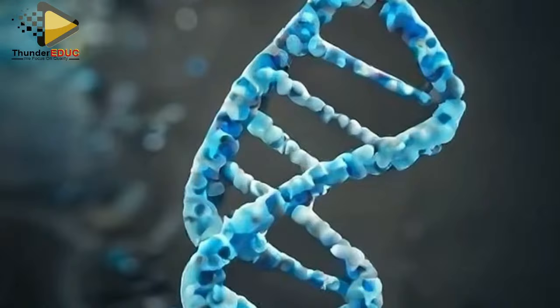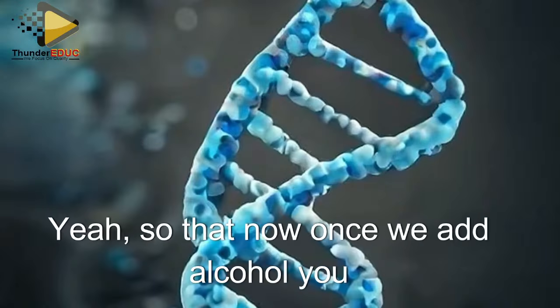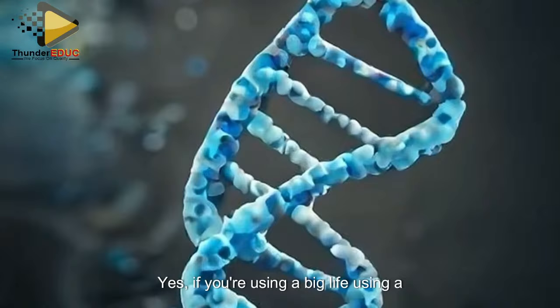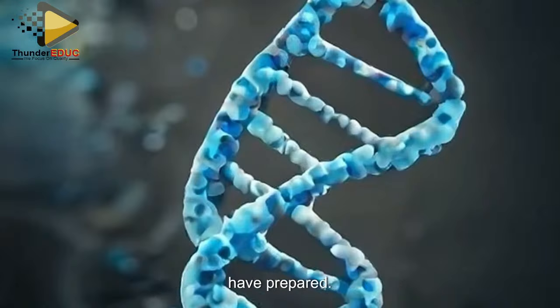Then we can talk about the alcohol. What is the alcohol used for? Basically, alcohol is used to precipitate the DNA from the solution. Once we add alcohol, you will see that two layers are formed. The white mist or wet cotton-like mass will be formed on top of the beaker. If you're using a beaker, or a glass, whatever you are using, you'll be able to see those two layers. So alcohol is very important in precipitating the DNA out of the solution, or the mixture you have prepared.